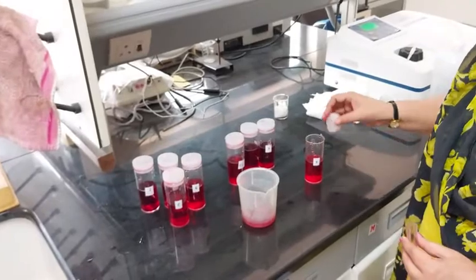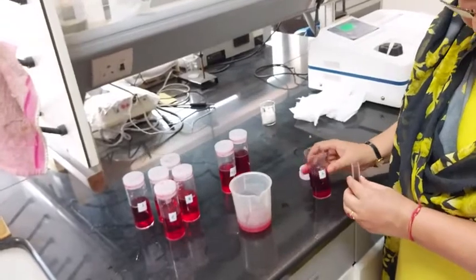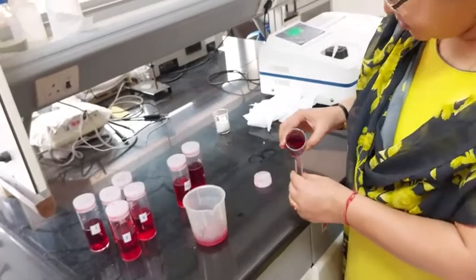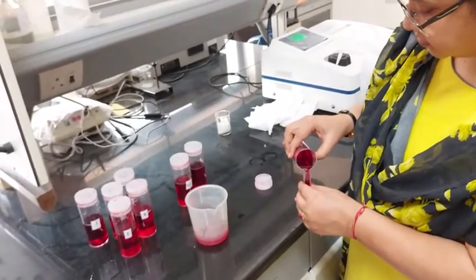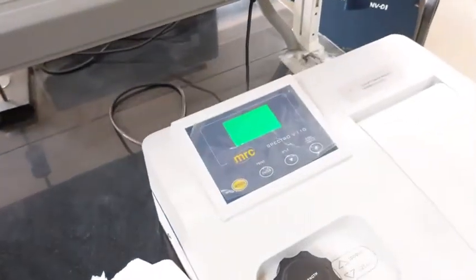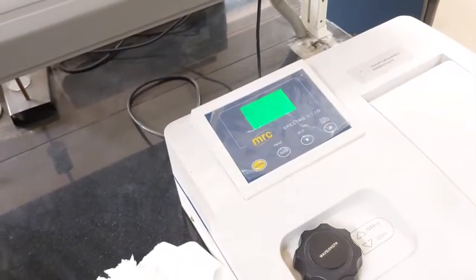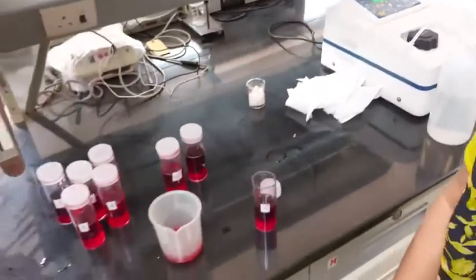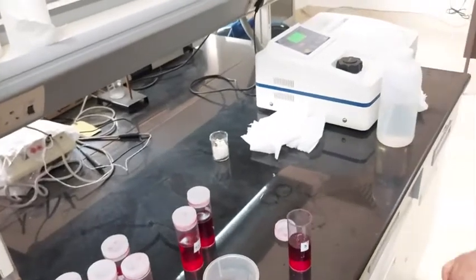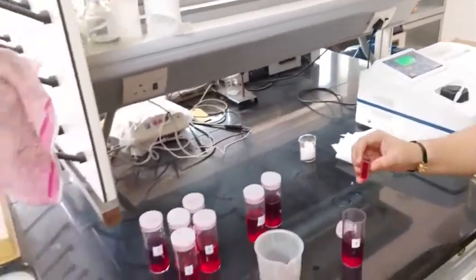Then it's the river water. I'm going to measure absorbance of river water. River water, it is coming out to be 1.136. Then groundwater.